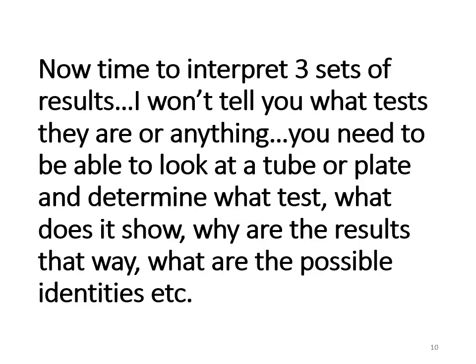So now we get to the fun part, interpreting 3 sets of results. Now I'm going to just give you these slides and I'm not going to tell you what the tests are or what you're basically looking at. Based on listening to the narration and seeing the previous slides, you should be able to look at a tube or a plate with a result and tell me, what test is that? Is it Bile Esculin? Is it Bacitracin? Are you looking at hemolytic activity? Okay, you should be able to tell me that type of information. You should be able to tell me why you are seeing the changes you see.